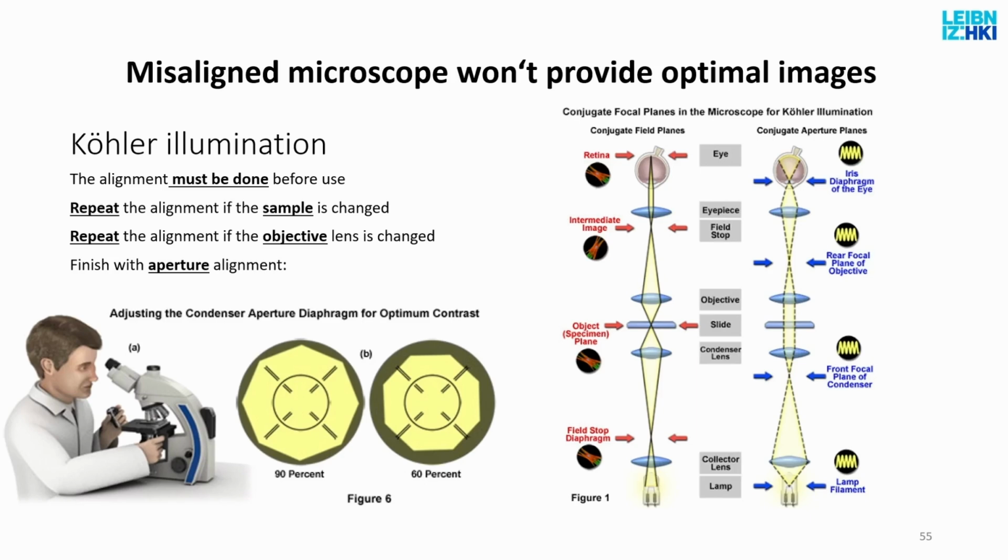However, this only works if the optical axis of this whole light path is set up very carefully. It's also important that the resolution is maximized, which is achieved by putting apertures in the light path to limit the width of the light beam that goes through the center. So this means that if I don't set up the optical axis and I don't align my apertures to match the center of the optical axis, I do get an image, but the difference in resolution is immense. If you ever played with such a system, you will know what I'm talking about.